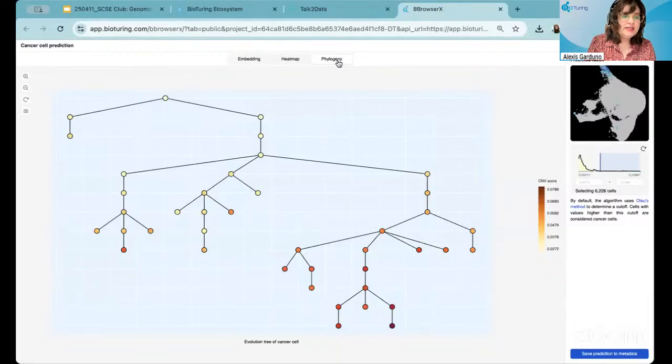What we can see here is that the lower right branches show mainly these densely packed dark red knots. That means these represent a very dominant genomic complex clone, possibly responsible for the disease progression or relapse within these treatment groups. Upstream, we see these lighter clones, which reflect the early stage or ancestral clones, which might more closely resemble the normal progenitor cells that were annotated within the study. So you can clearly see there is a very clear difference where you have these normal progenitor cells that are transitioning into these actual malignant cells that have clonal instabilities within the samples. So these are analyses again within just the functionality.